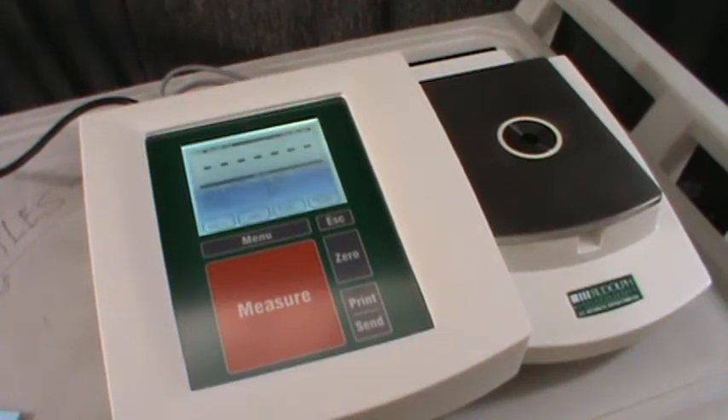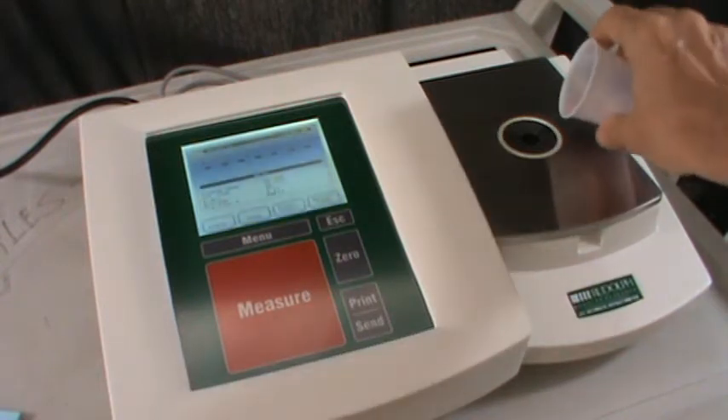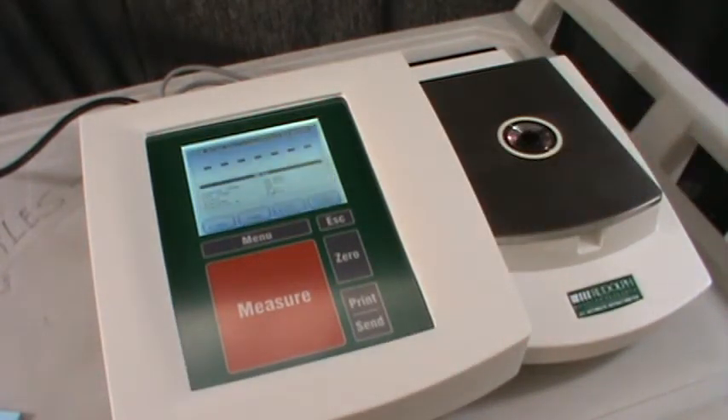To check the function of the refractometer, simply place a sample on the prism dish and press the measure button. The instrument will bring the sample to the reference temperature, usually 20 degrees for Brix measurement, and then measure it.